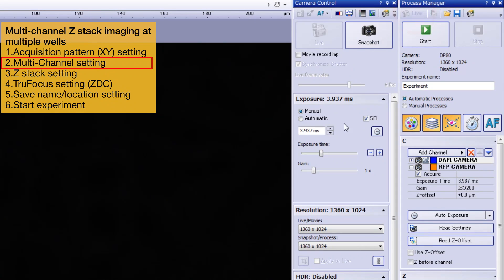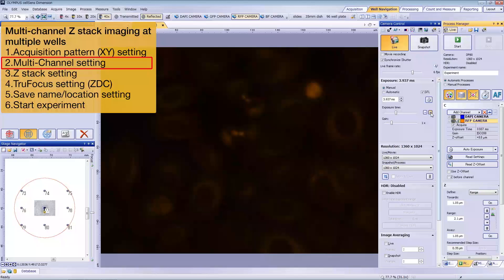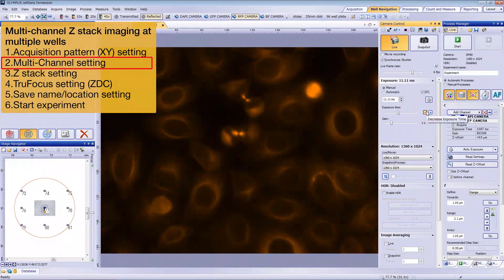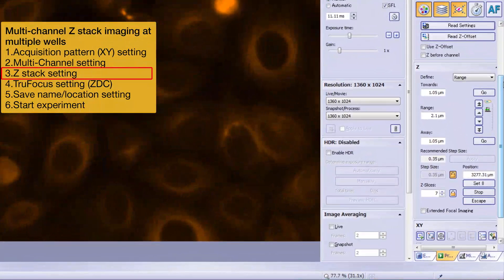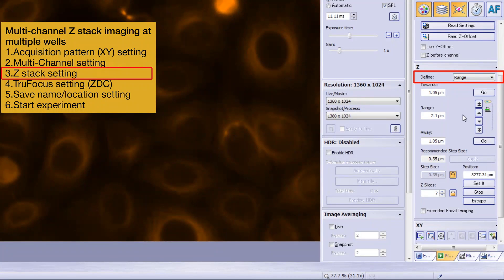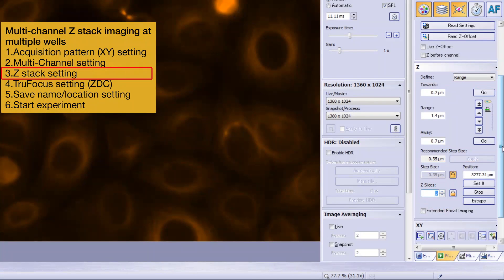Start live and adjust the focus and exposure time. Click Read Setting to register the current exposure time. Repeat this for the RFP channel, then click Read Settings. Stop live and we'll adjust the Z-Stack settings. Select Range to acquire a Z-Stack centered on the current Z position. The optimal step size can be calculated using the theoretical optical Z resolution. Click to apply the recommended step size, lock the step size, and then decide the number of Z slices — let's set it to 5. Checking Z Before Channel can shorten the acquisition time by reducing the number of filter turret rotations.